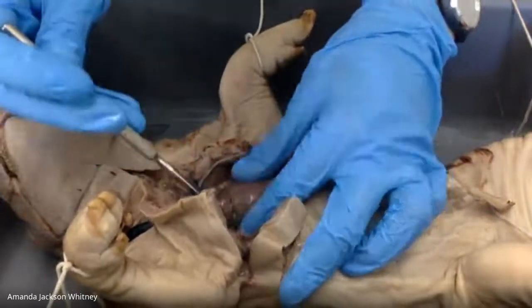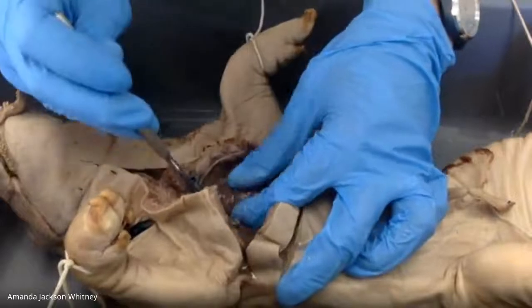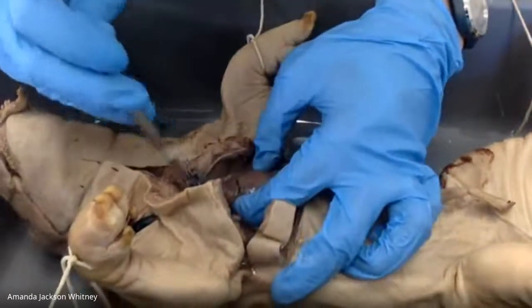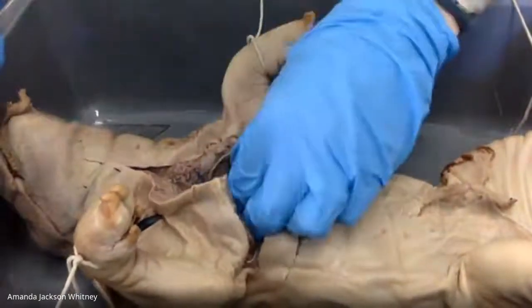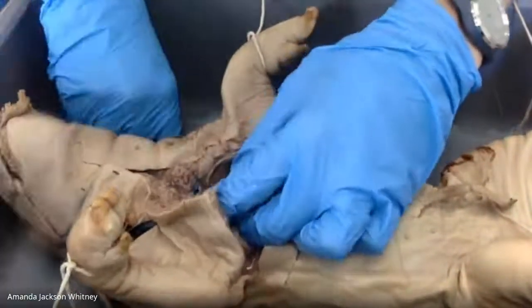There's a dissection where it asks to identify the pyloric and something valve. Is that the heart? Those are in the stomach. So if you cut into the stomach, you'll be able to see those. Oh, I'm supposed to cut into the stomach. Cut into the stomach.